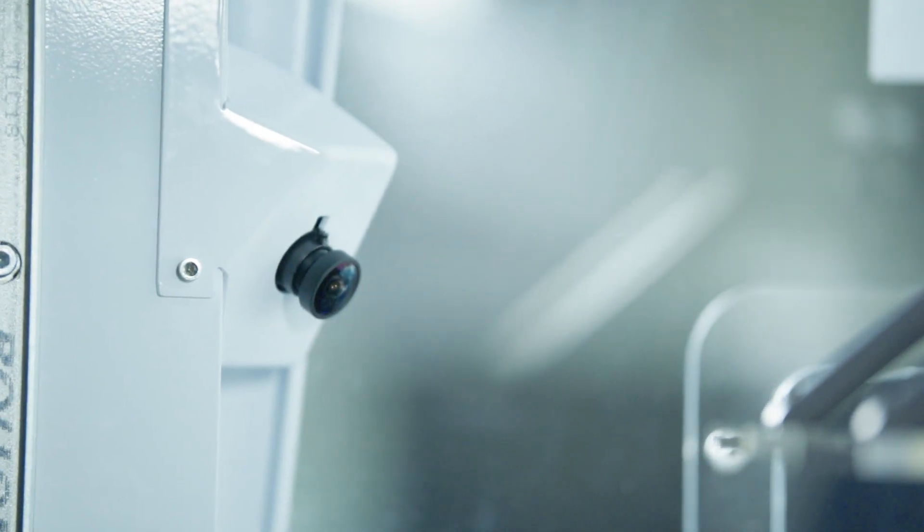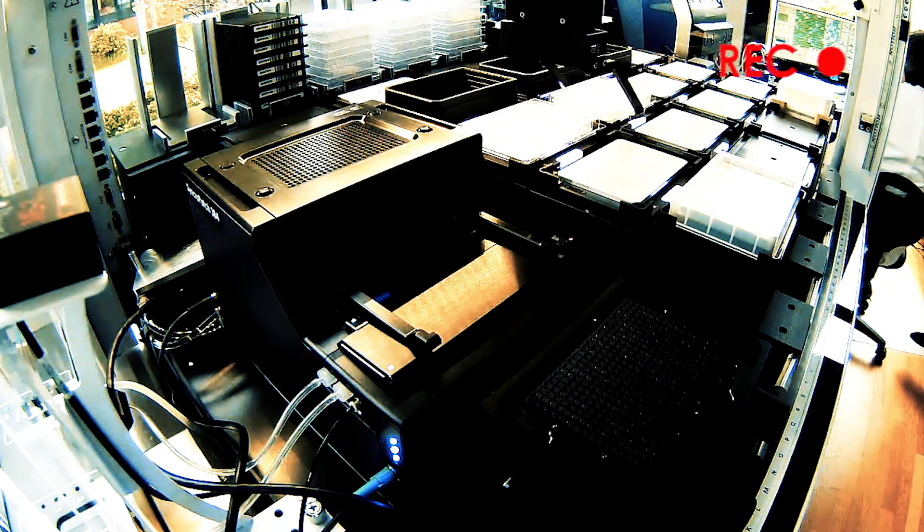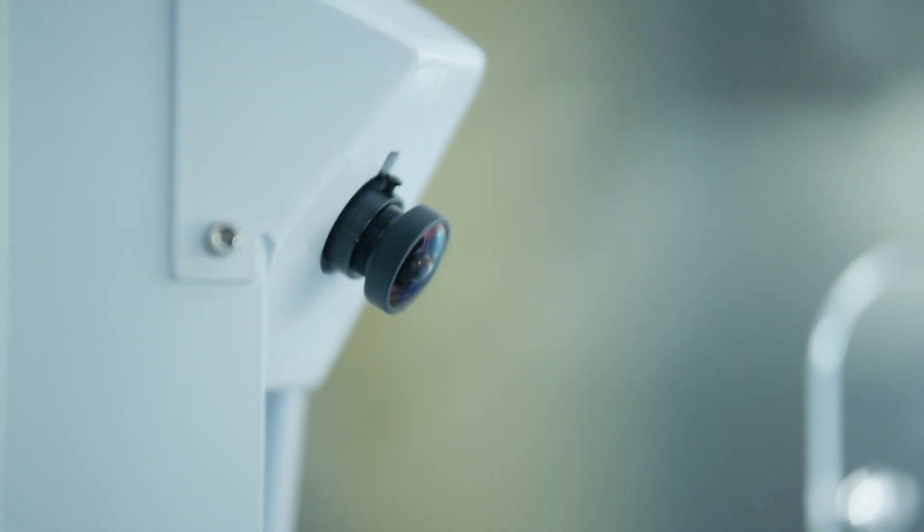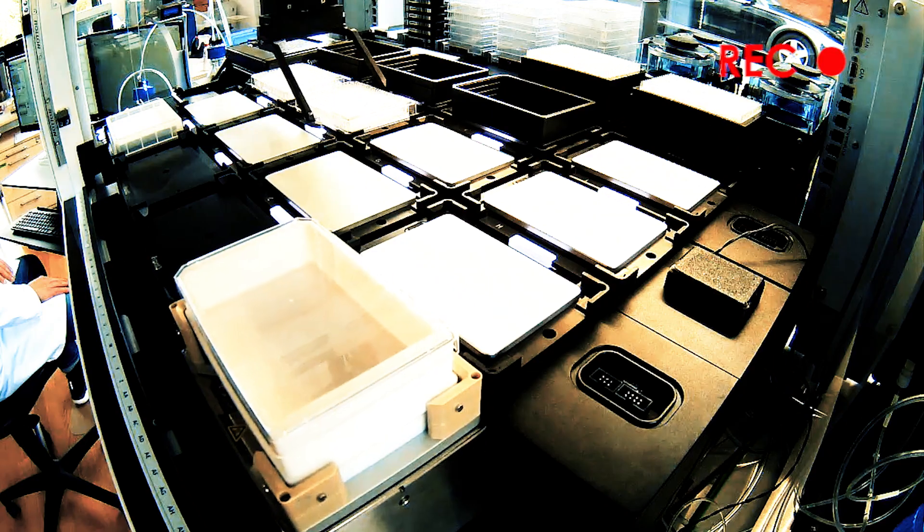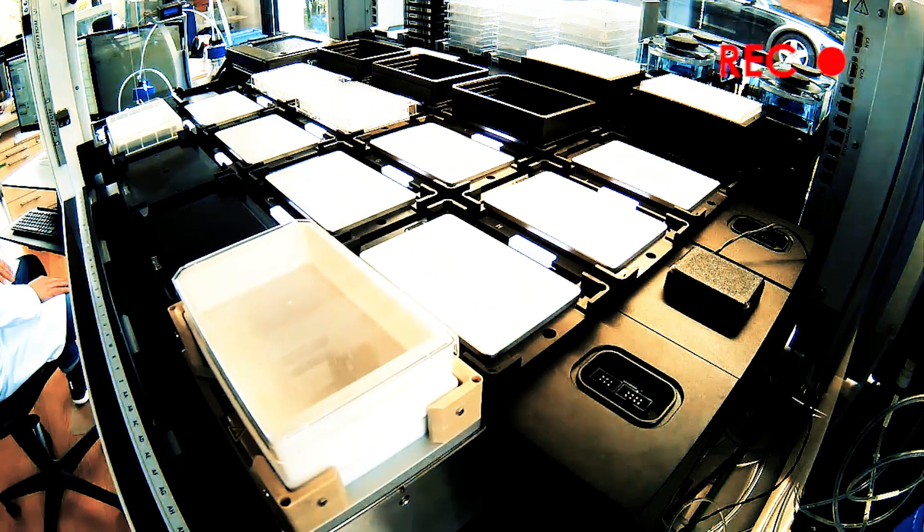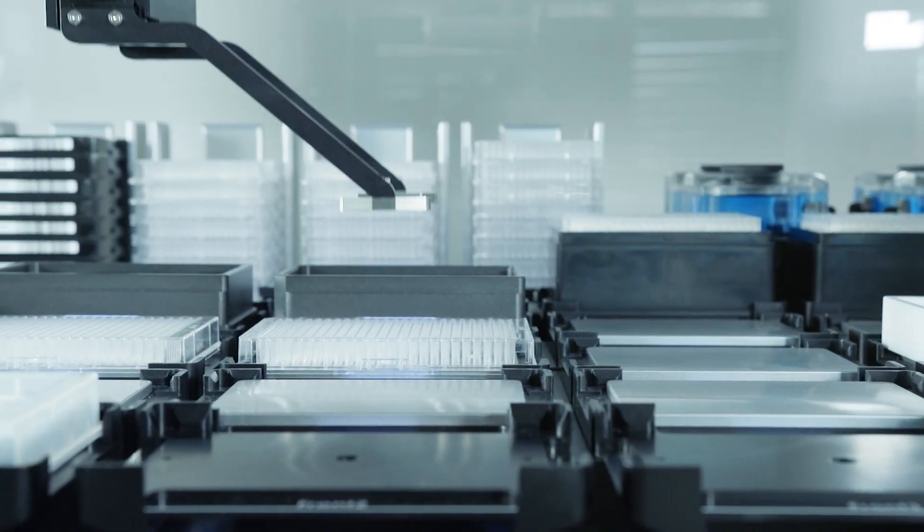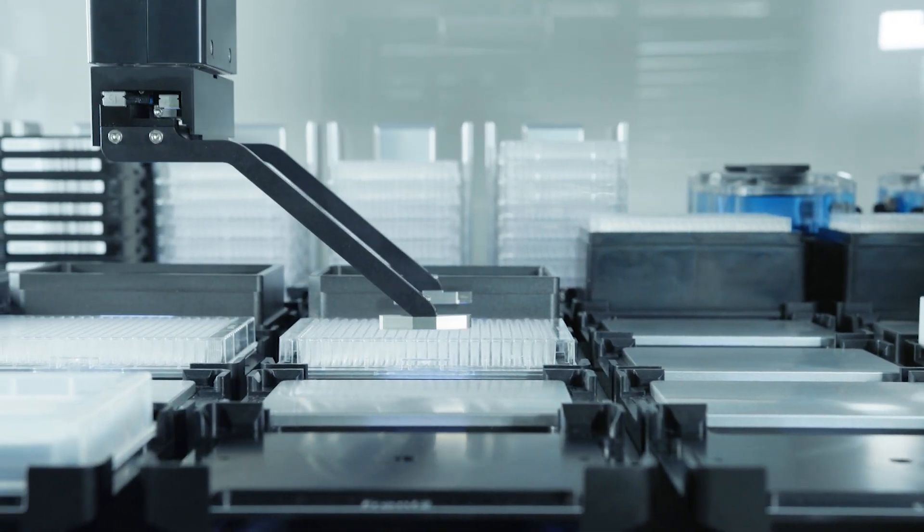Your time is important. Benefit from expert assay development and exceptional technical service and support to minimize downtime and maximize productivity.